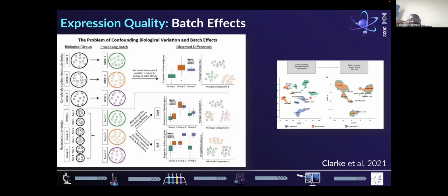But this is what you expect to see. And in real life representation, you can think of it this way, whereby you have T cells, NK cells, monocytes, everything just being mixed up in a UMAP. But then a good cell type separation is whereby you have T cells separating uniquely compared to monocytes and all the other cell types, each of them being independent in a cluster.